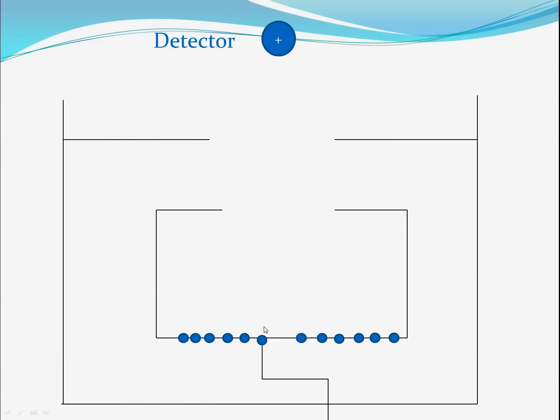Second ion, here's my second ion. It's gone straight through. What a marvellous ion it is. And now electrons are attracted to it and they're starting to spin. You can see it causes a gap and the electrons shuffle over and take its place. And this causes a current to form, showing an ion has been detected.